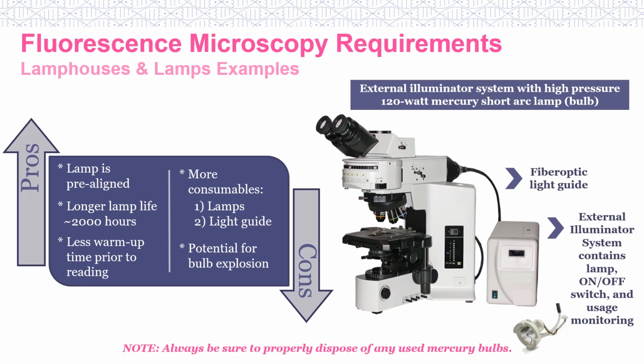Again, please note that you should not touch the lamp's surface, as fingerprint oils can cause it to prematurely fail. And if your laboratory is using any mercury bulbs, be sure to always dispose of them properly in accordance with your laboratory guidelines. Before leaving this slide, it would be remiss if we did not mention that external illuminators can also be purchased as LED systems.